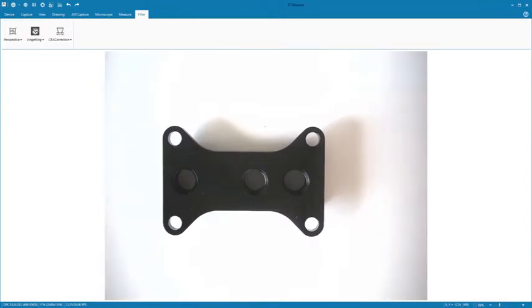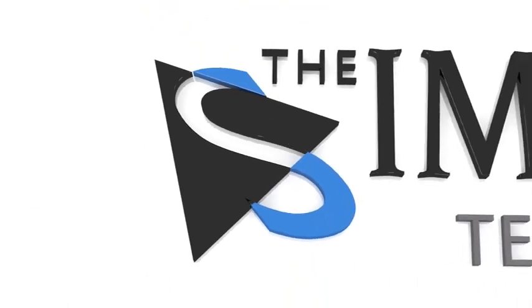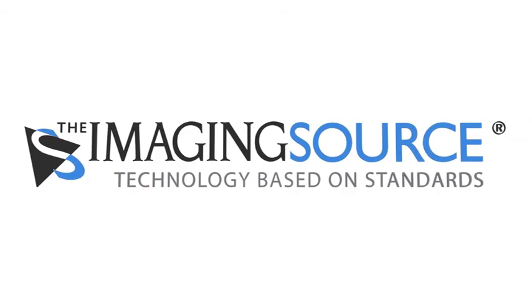In case of additional questions, help in the topmost right area of the screen offers additional information and advice.